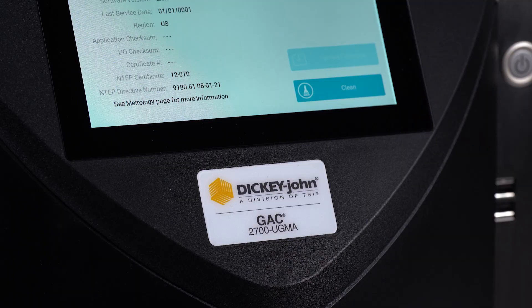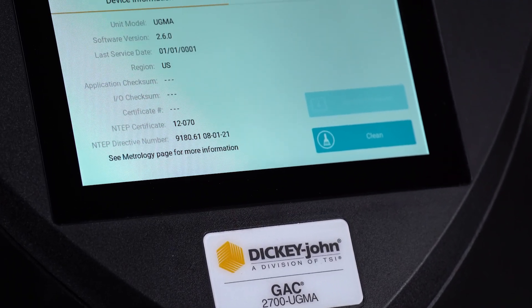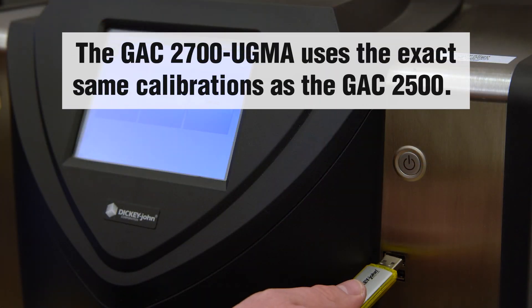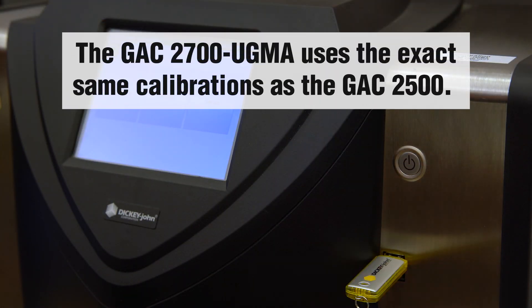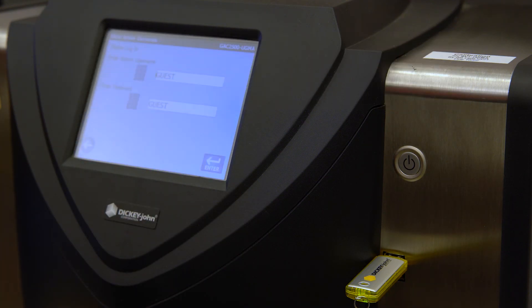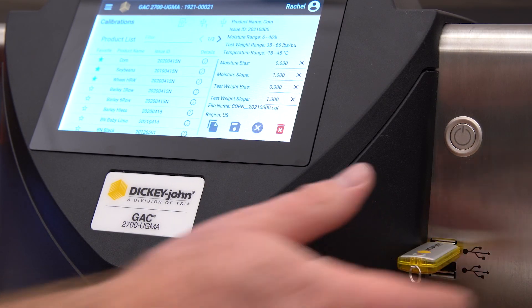This instrument is NTEP certified for commercial grain trade and FGIS certified as UGMA compatible. The exact same calibrations are utilized for both the GAC 2700 and GAC 2500 grain moisture analyzers, which will reduce the likelihood of confusion or mistakes during the calibration updating process.